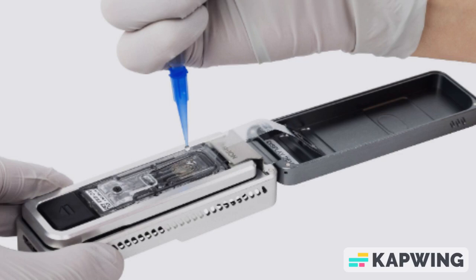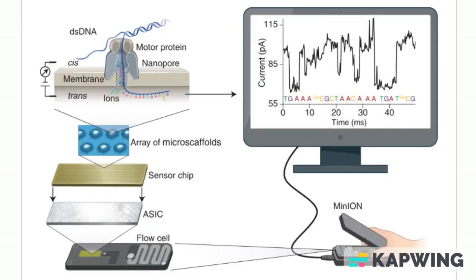In this sequencing technology, the first strand of a DNA molecule is linked by a hairpin to its complementary strand. The DNA fragment is passed through a protein nanopore. A nanopore is a nanoscale hole made of proteins or synthetic materials. When the DNA fragment is translocated through the pore by the action of a motor protein attached to the pore, it generates a variation of an ionic current caused by differences in the moving nucleotides occupying the pore.